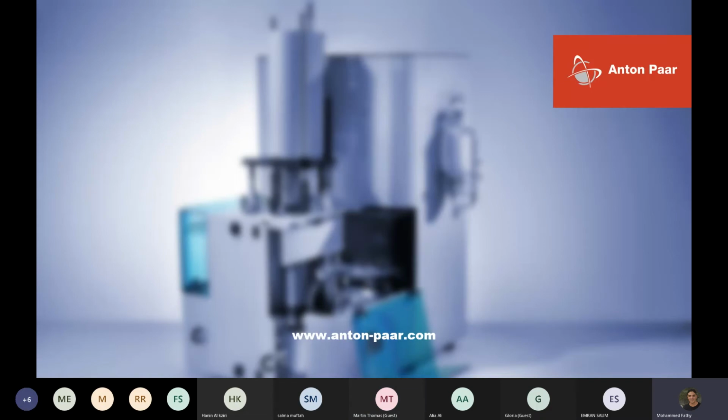Yes, I have one question regarding the switch from the low pressure to the high pressure mode with the porosimeter. Do we need a special tool to transfer the cell from the low pressure to the high pressure? Is there any hazardous precaution required for this?